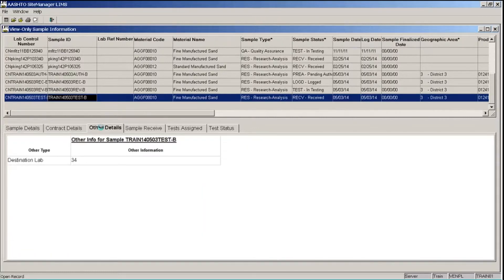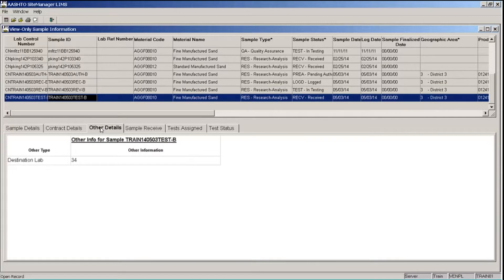When I click the Other Details tab, this shows the destination lab or your organization which is associated to the sample.